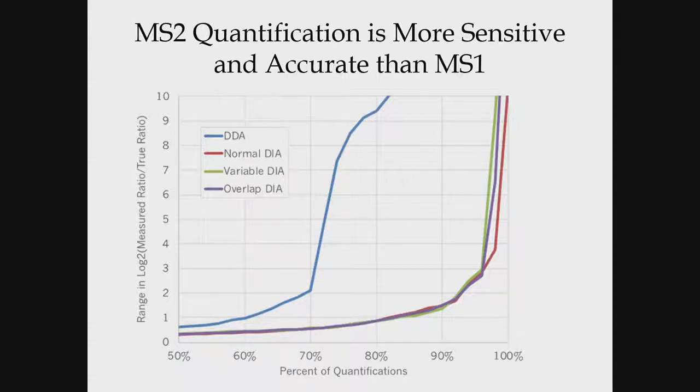Yeah, so that just shows you, I'm not saying that data-independent acquisition is perfect, and I'm also not saying parallel reaction monitoring is perfect and is the actual right answer either. It's just saying that we are expecting that is going to be the best case scenario in this case. And so if you are looking at twofold deviation from the parallel reaction monitoring data, it still does have some sort of deviation.